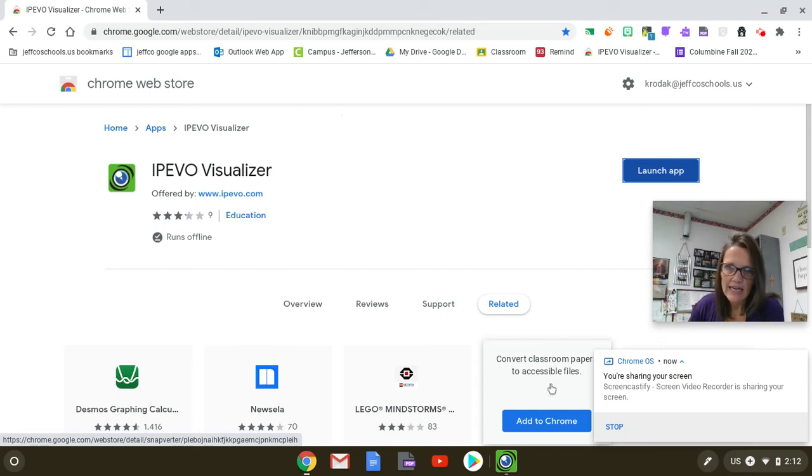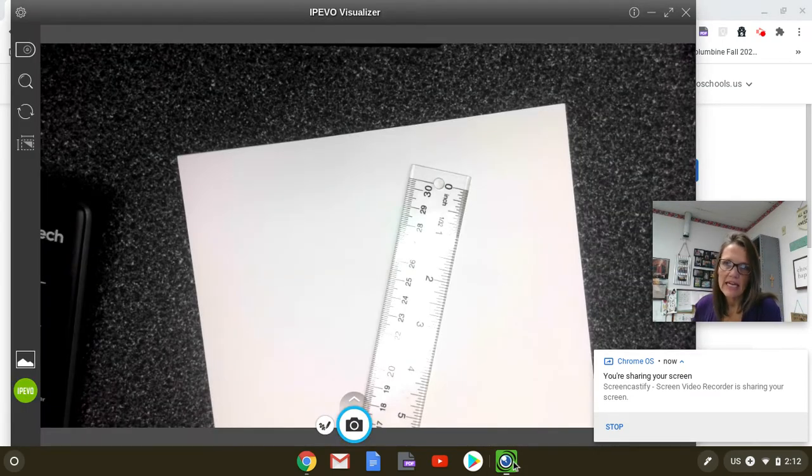Hello, I am going to take some time today to show you some of the common pieces of equipment that we will use in the chemistry lab. Most of this stuff you're probably all familiar with or have at least seen. So we just want to make sure that we're using the correct names for items.